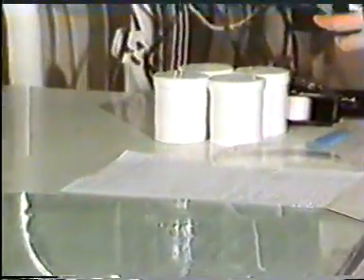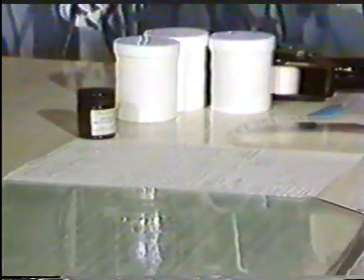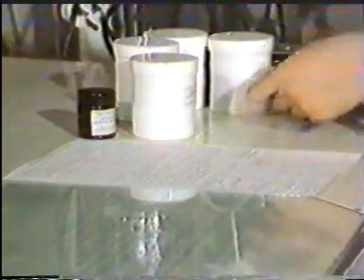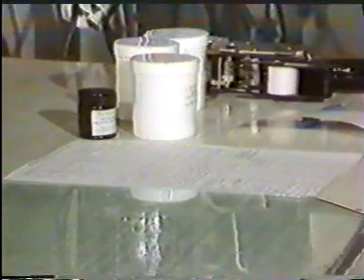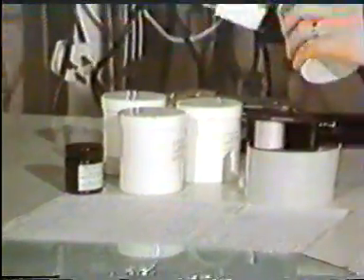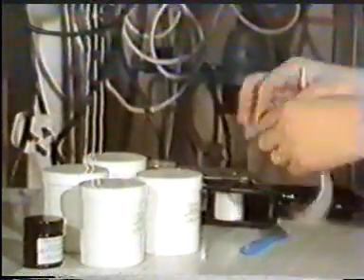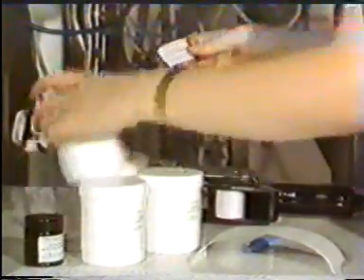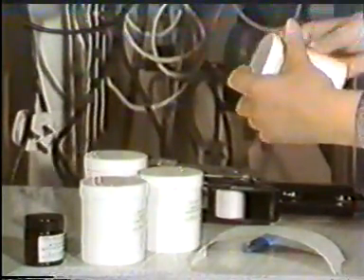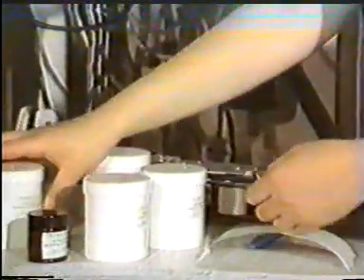The final procedure in the manufacturing process is labeling. Each container is labeled with the labels issued for that product, which should show batch number and expiry date in accordance with the master worksheet. An example of the labels used should be attached to the batch sheet. A specific number of labels is issued, and these must all be accounted for at the end of the process. This is known as label reconciliation.